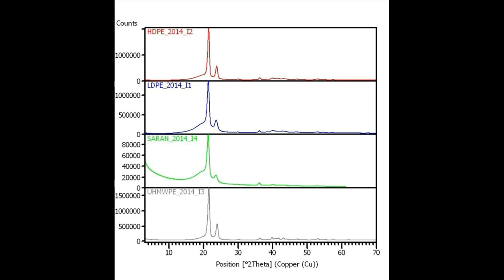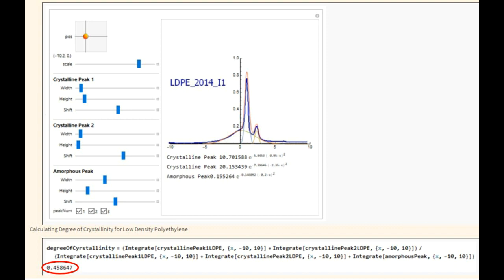The expected value for degree of crystallinity for low-density polyethylene is 44% to 51% crystallinity. The value obtained using Mathematica peak fitting was 46% crystallinity, so this is within the accepted range.